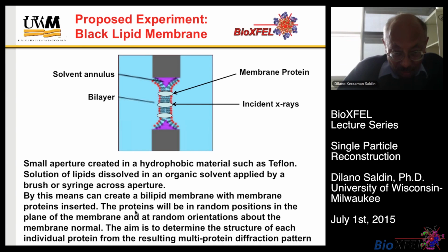Now, as I said, in general, with something like a K-channel protein, a potassium channel protein, or an ion channel protein, they tend to orient themselves in such a way that the central pore lies perpendicular to the membrane. And so they take up an arrangement rather like this. Now, if incident X-rays come in this way from one side of the membrane, one can imagine a detector on the other side which will measure the diffraction pattern.